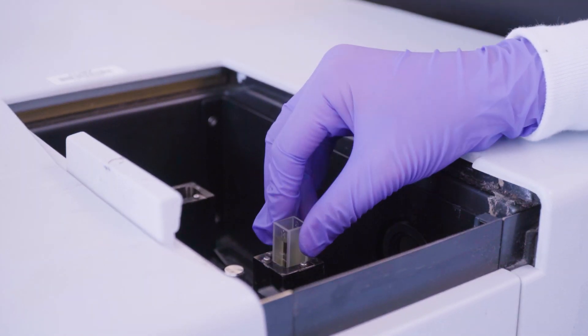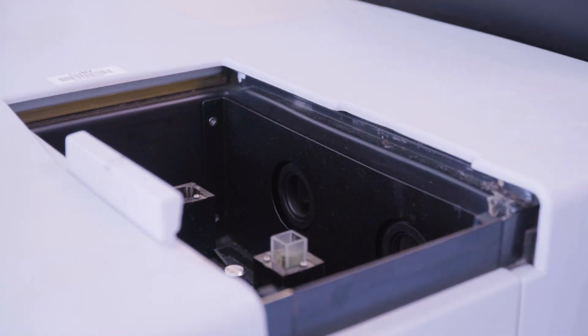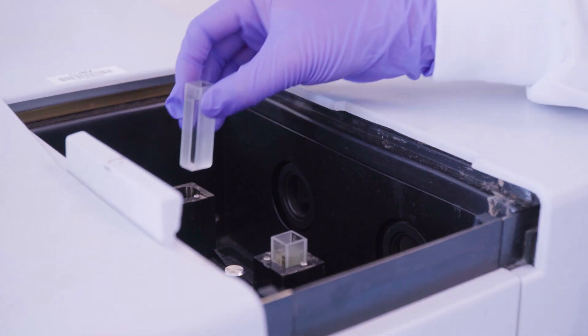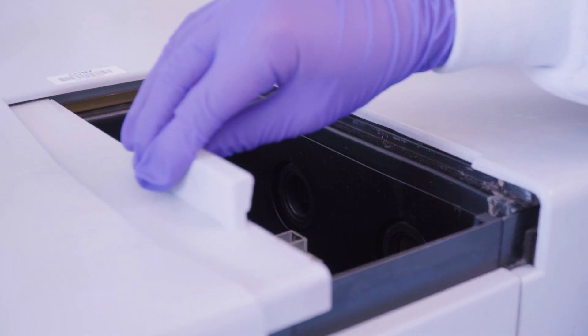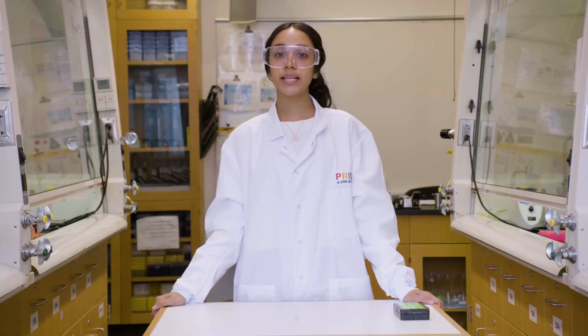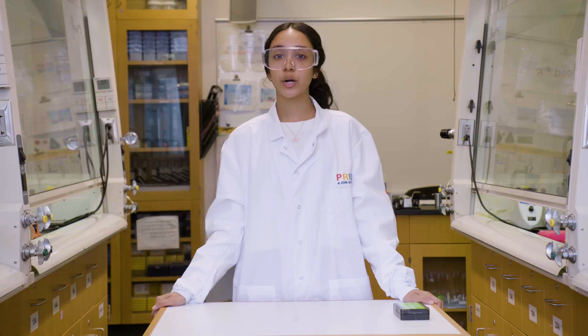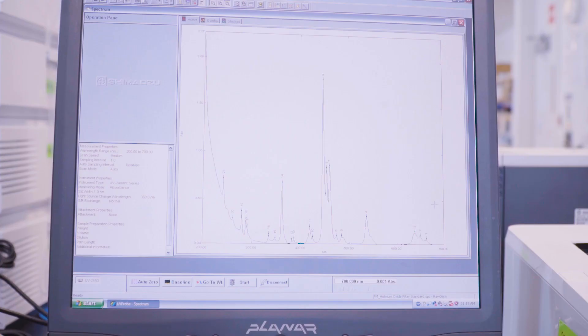For those using a double beam instrument, place a sample cuvette in the front and the reference solution in the back. Close the door tightly to prevent any light from leaking into the sample compartment during analysis. Click the start button on the screen to begin the run.